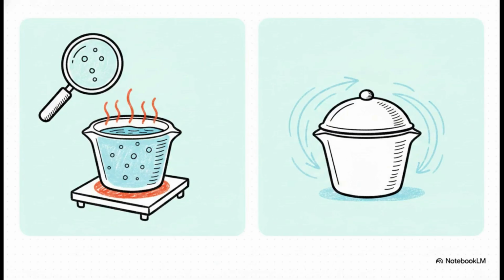So, once the zinc is dissolved, we have to isolate our newly formed compound by removing the liquid. And notice the strict contrast between the heating and cooling phases here.